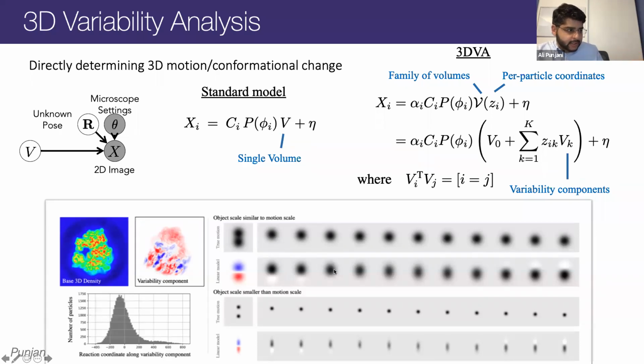And what we see is that it's a pretty good representation of the motion of the dot, especially if you consider thresholding this density at a certain level. Like, for example, when we visualize molecules in Chimera, we threshold the density at a certain level. Then we would definitely see the dot moving exactly the same way as in the original data.